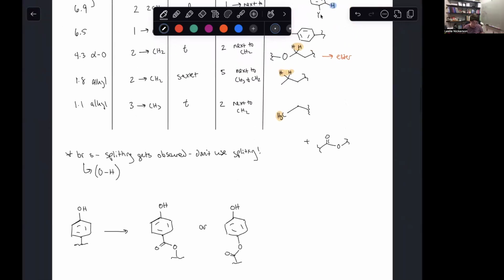So if I'm looking at my other fragments and thinking about what I want to do next, the thing that gets me really messed up here is this piece. If I have this oxygen that needs to be next to a CH2 that's next to another CH2, I can't do that here, right? I'm basically stuck and I can't be including that kind of piece.